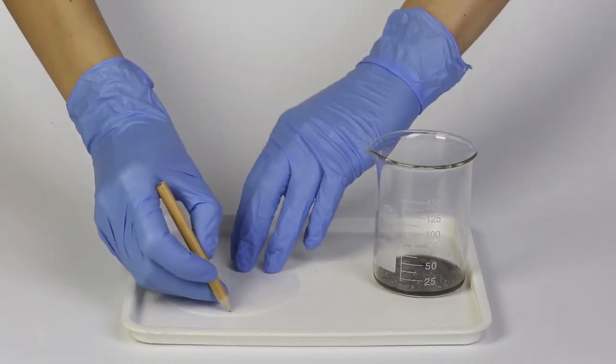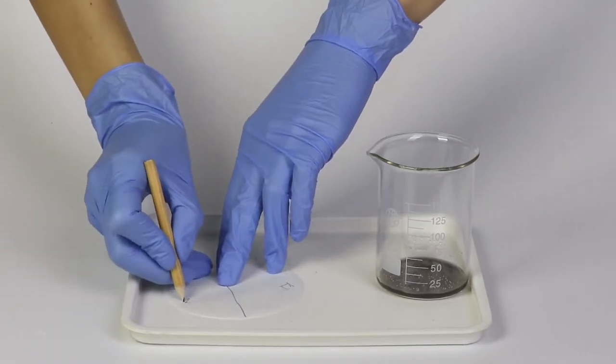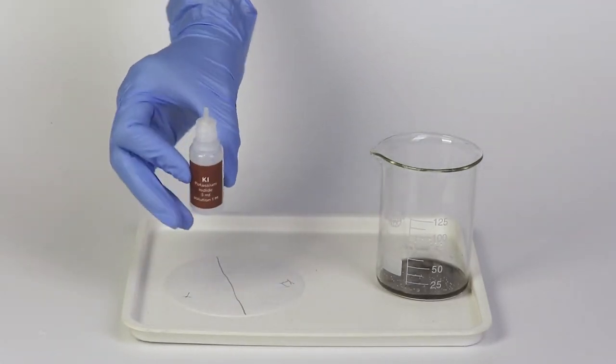Now, take a sheet of filter paper and draw a pencil line down the middle. Label one side KI for potassium iodide and the other T for thymol blue.